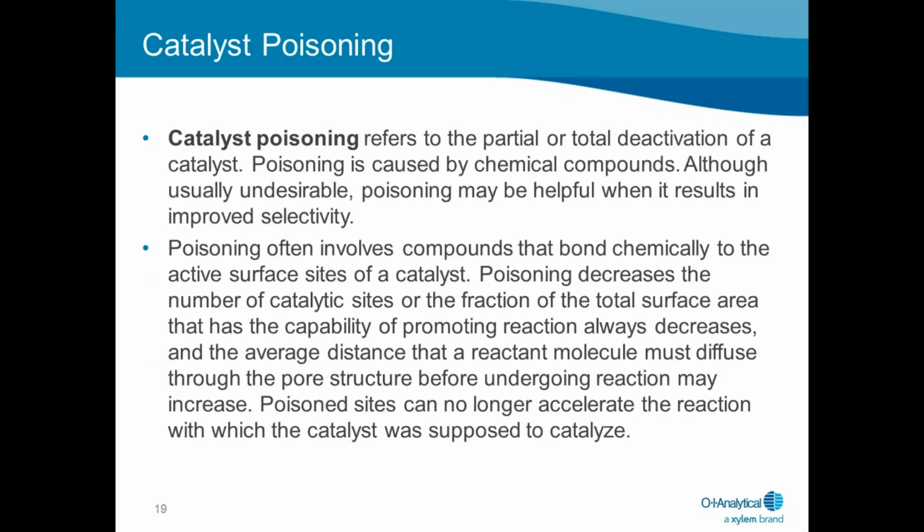One note about the use of sulfuric acid and catalyst poisoning. The conversion of carbon-containing compounds to carbon dioxide occurs on the surface of a precious metal catalyst in the presence of oxygen. If the active sites of the catalyst are not available, then no reaction occurs. Atoms, such as sulfur atoms, bond easily on the surface of a catalyst, thereby preventing the reaction. This is one of the reasons why I believe that sulfuric acid is not desirable in combustion TOC.